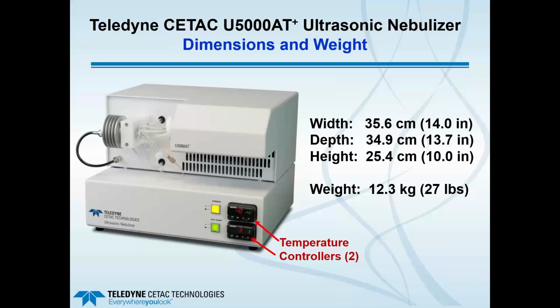Here is a front view, and we'll see pictures of this in the laboratory setting, but this gives you an idea of the dimensions and, of course, the weight of the system. It is essentially a benchtop system, or a system that can be easily placed on a laboratory cart and then connected to the host ICP-OES.